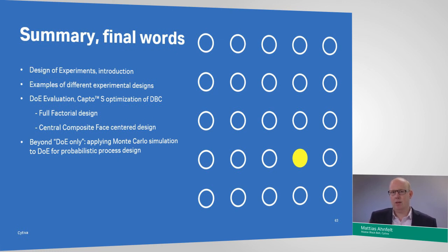So with a DoE that would only support a linear model with two-way interaction between pH and salt, we saw that complexity was not enough. We saw it in the residuals. So we always start out with evaluating the error part, the residual part, looking to see if there's any structure or systematic variation left in the residuals, also see if we have any time-dependent trends and so on in the residuals, in the error part.